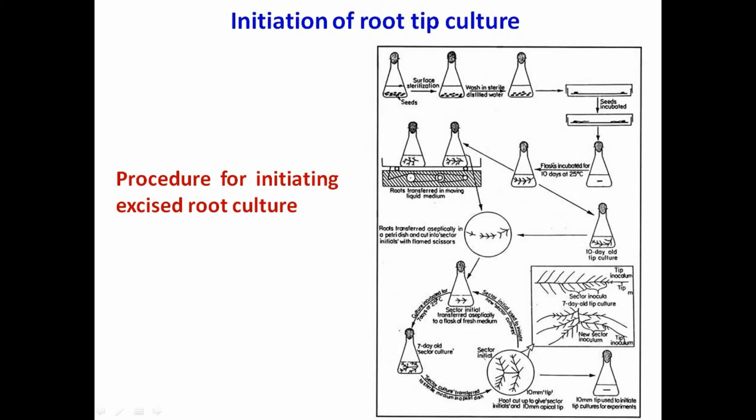Decant the ethanol into the 500 ml beaker and replace with the chlorine solution. Replace the cotton wool plug and leave for 20 minutes. Ensure that the seeds sink in the solution by checking the flask. Then decant the chlorine solution into the beaker and wash the seeds with sterilized distilled water three times.